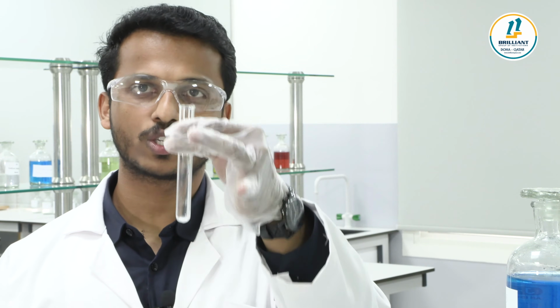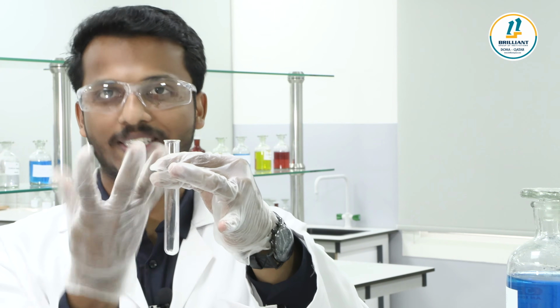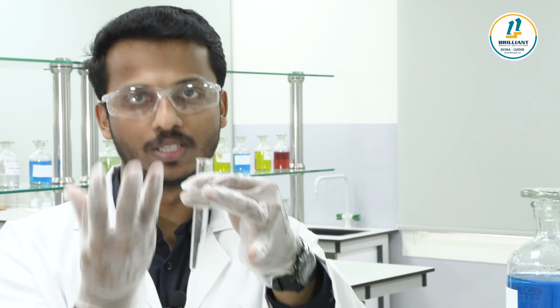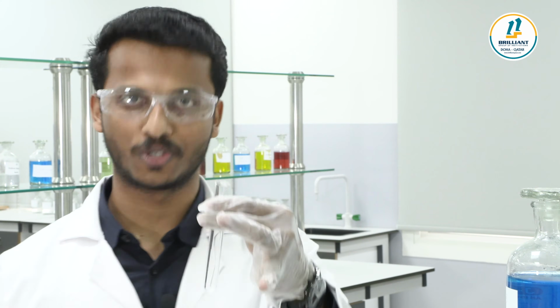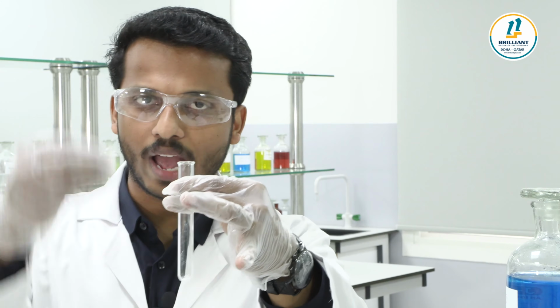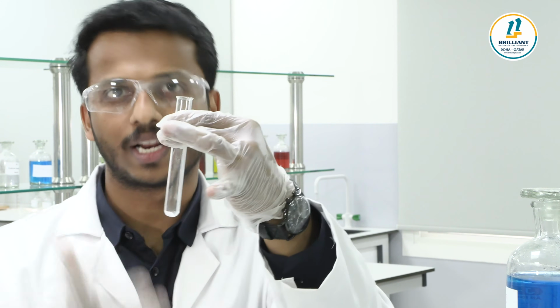Before doing the experiment, we have a clear idea of the observation. What is the observation when you add dilute hydrochloric acid to this salt? Brisk effervescence. What is meant by brisk effervescence? Bubbles, carbon dioxide produced. Very carefully, at the moment when you add the dilute HCl, at the same instant you have to observe whether there is bubble generation or not.